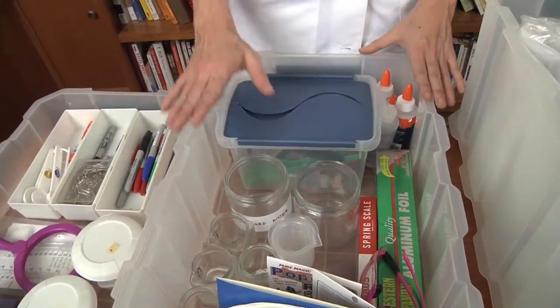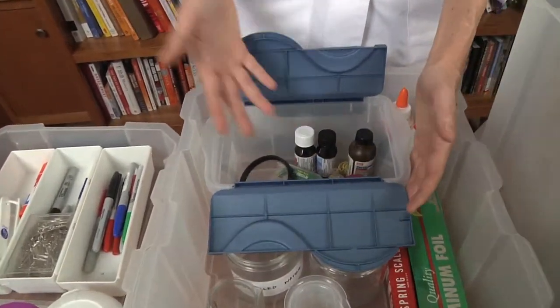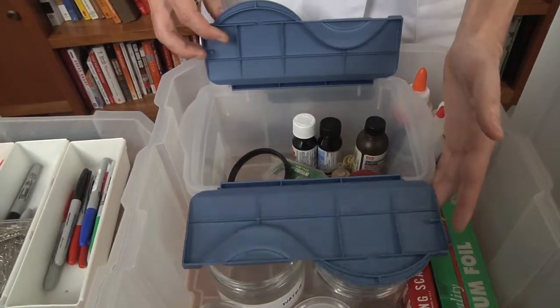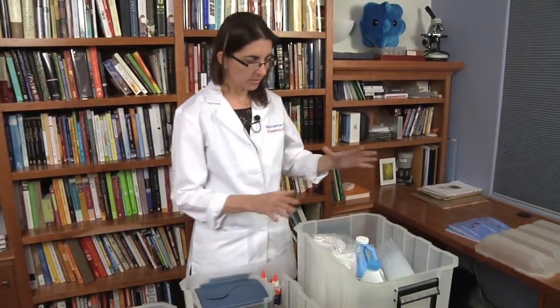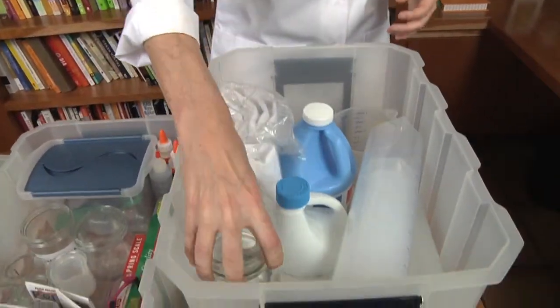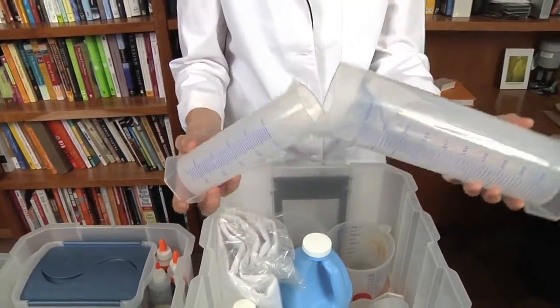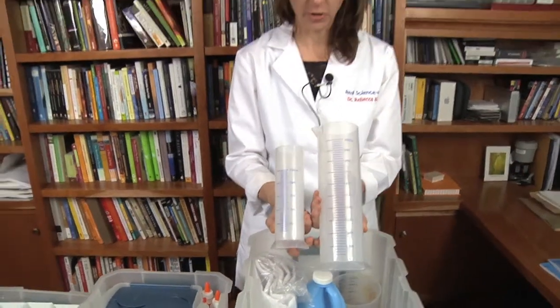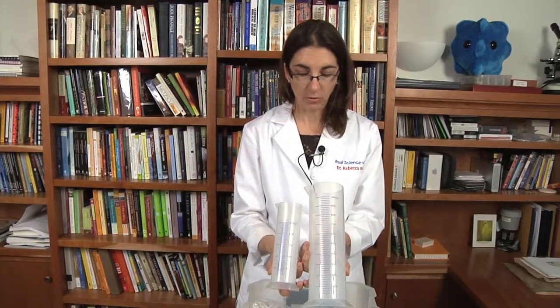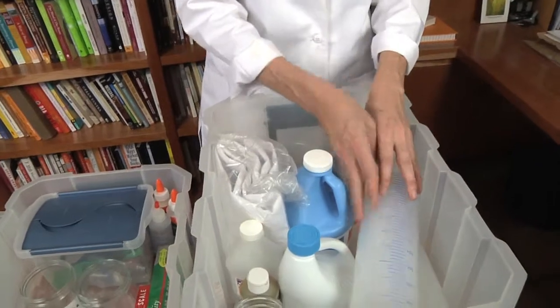I also have in this bin my coffee filters, and I have a smaller section here for a number of smaller items. For the largest section, you can put some of your larger items. In this piece, I have some larger jars that I use for some of the experiments. I also bought these graduated cylinders. You don't have to use these, but if you want, again, to measure larger volumes, in chemistry labs, students use graduated cylinders to measure volumes. So you can purchase those if you want to use graduated cylinders, but you don't have to.